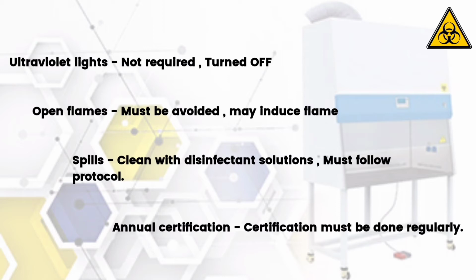Spills. If there are any spills inside the cabinet, they must be cleaned immediately with a disinfectant solution. We must use effective disinfectant to reduce aerosol generation. Materials which are exposed to the spills also should be cleaned properly. Personnel must follow the protocol given for handling these spills.